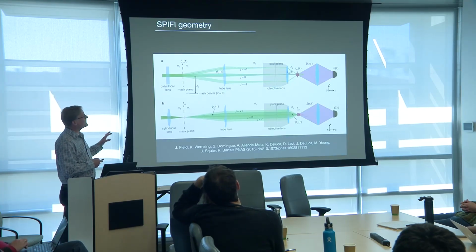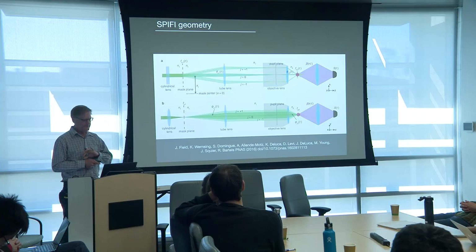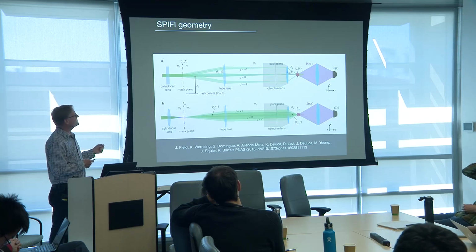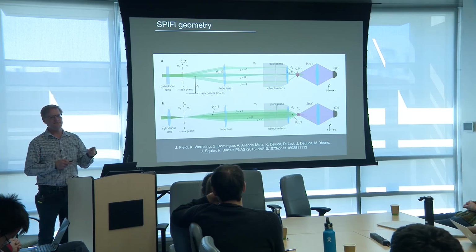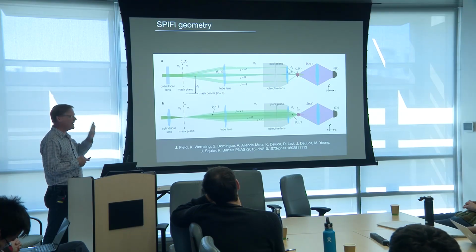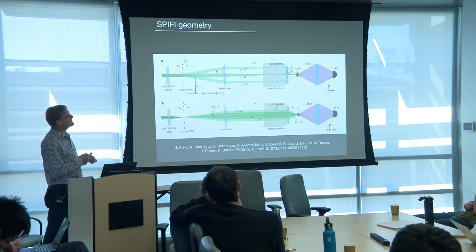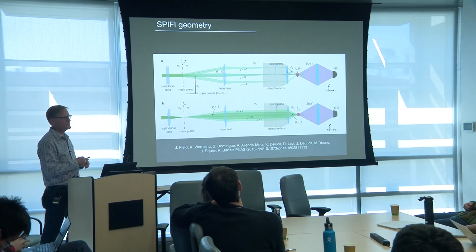And so to understand how we get extended resolution out of this, you've got to switch from the time picture and prep yourself for the spatial frequency picture as well. So that's what this does. If I'm looking down on the mask, think of that mask as acting like a diffraction grating whose ruling lines per millimeter is changing as a function of time as you rotate it. And I'm ignoring higher orders here, just for simplicity today. We get a 0 order beam that comes through, a 0 order light sheet, and then we get the plus and minus orders, and I'm just showing the plus or minus 1 orders that come out.